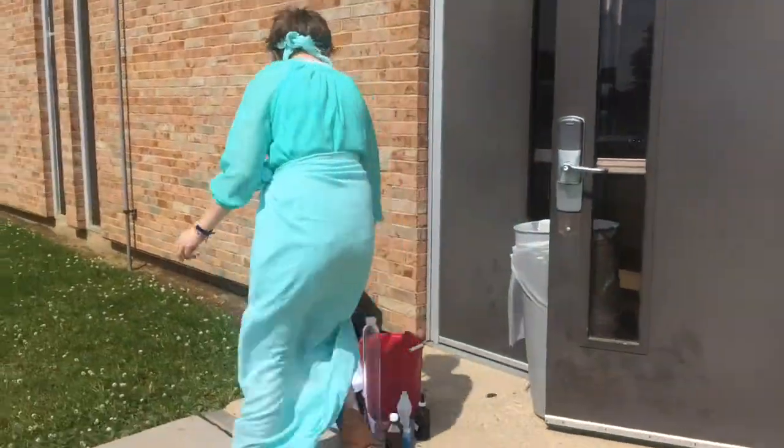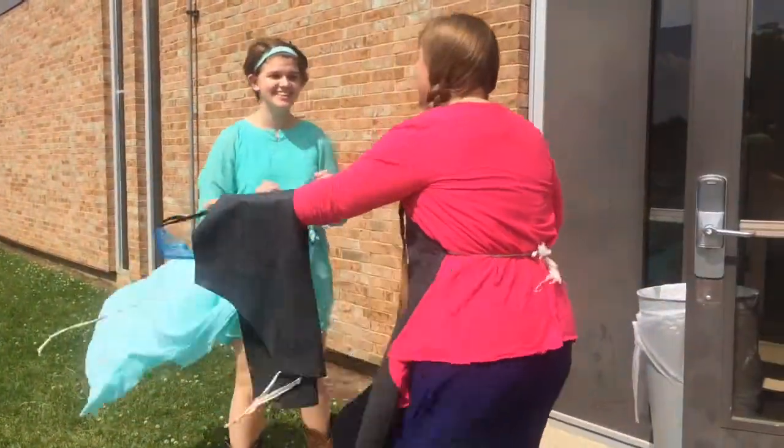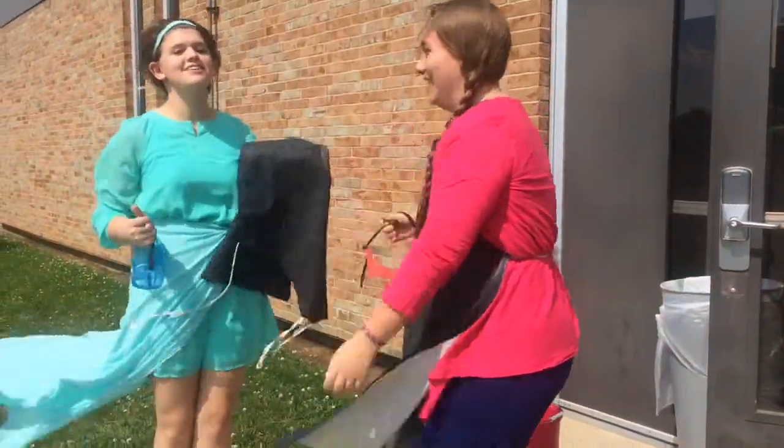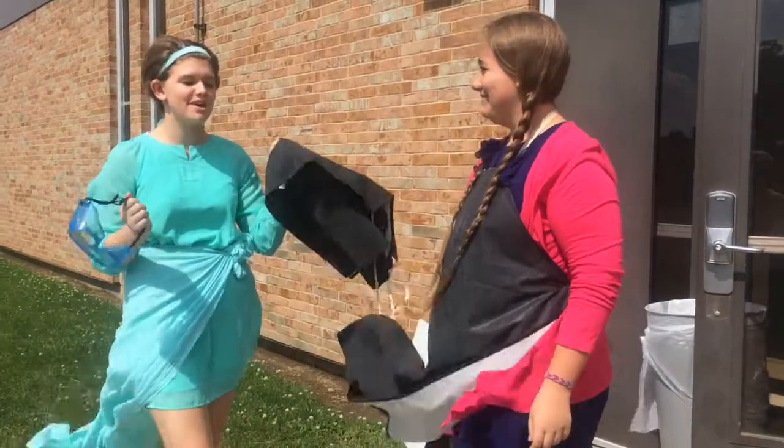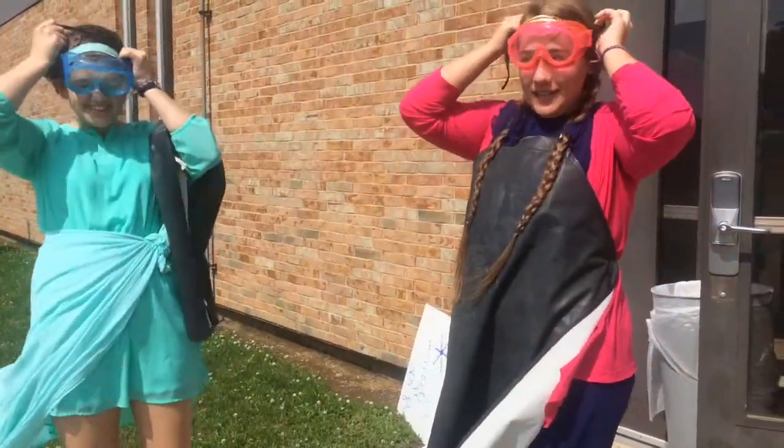Alright, here we go. Elsa, wait! You need this. Oh yeah! Make sure when you do any lab experiment you wear your safety goggles and your apron. Always. Thanks for reminding me. Just like this.